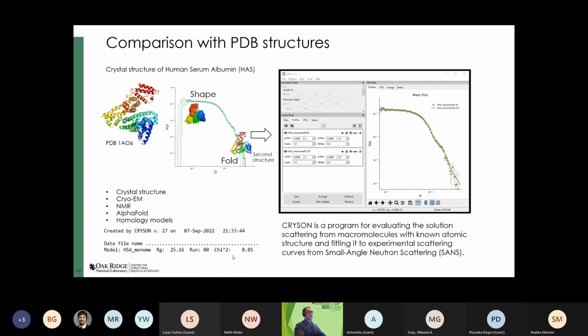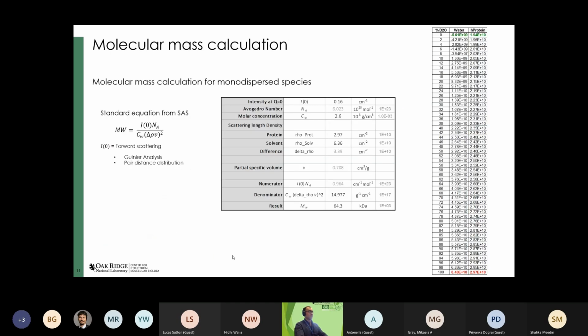0.85 is a good fitting. So we always want to get good fitting of our data. So chi-square of one is ideal. So we want to get a lower chi-square. That is, we also want to provide good models to our data. That is the main goal of doing those kinds of fittings.